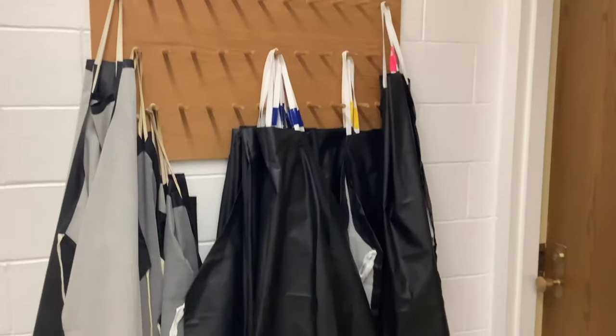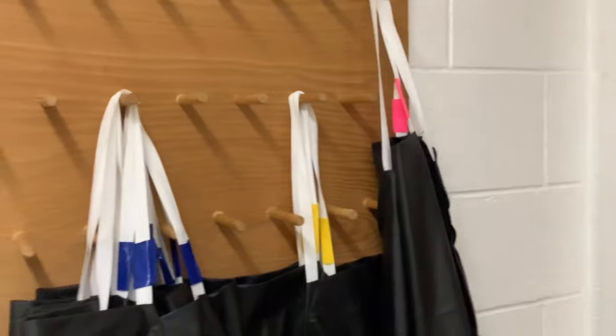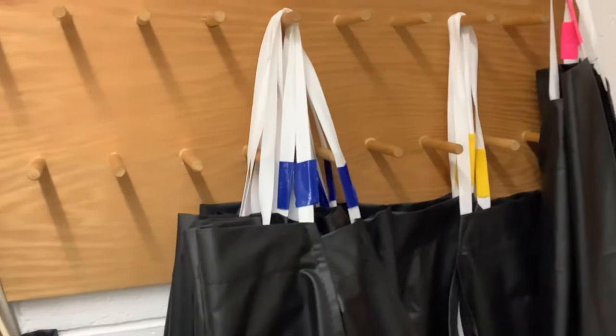This is another life hack with the apron — not only the carabiners and the loops, but also the color coded neck with a little piece of tape on there.